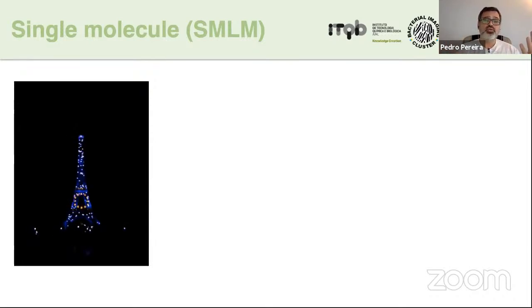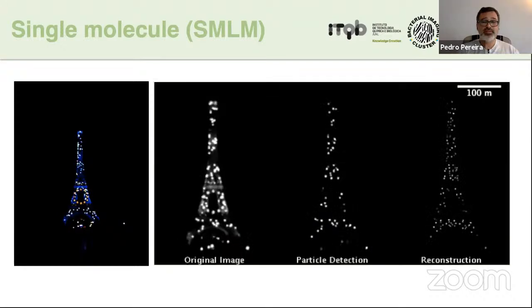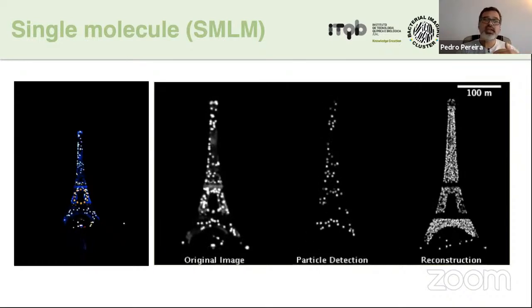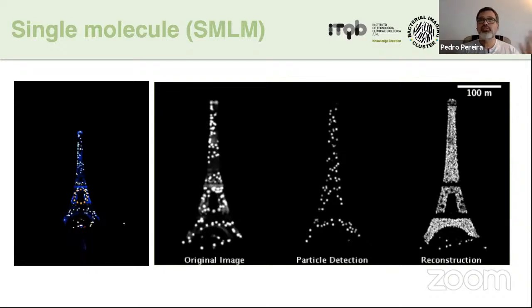Obviously, if what I've been telling you is true, spoiler, if I apply the same concepts that I just showed you to this movie, I will be able to get a reconstruction of this movie. And indeed I can. So if I just focus on the different blinking molecules that are showing up in this movie, I can see the original, the particle detection, and the reconstruction. And this way have a super resolved image of the Eiffel Tower, okay?